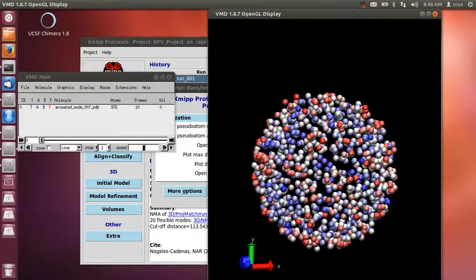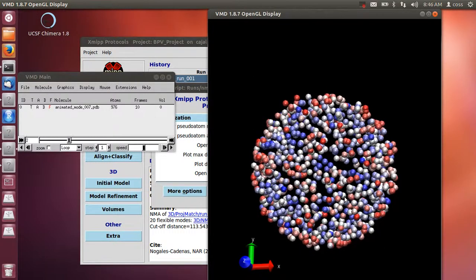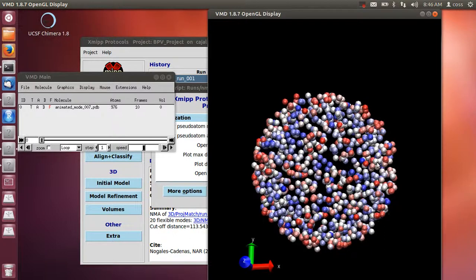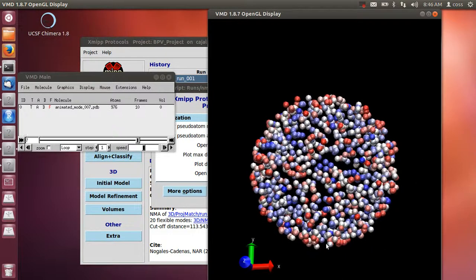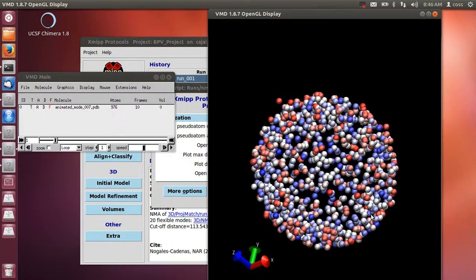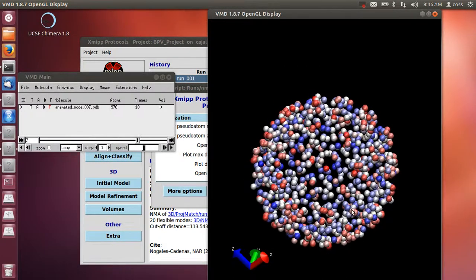This movement for the moment doesn't need to be represented in your images. We'll see later how to analyze this, but the idea is that the possible movements in your volume can be expressed as a linear combination of these movements that make a basis of the possible movements that you have according to normal modes.